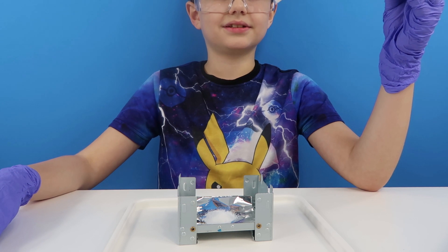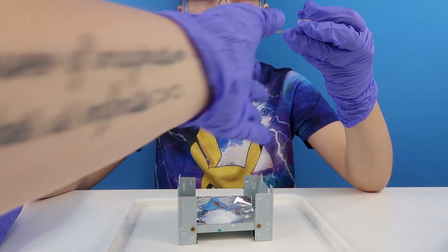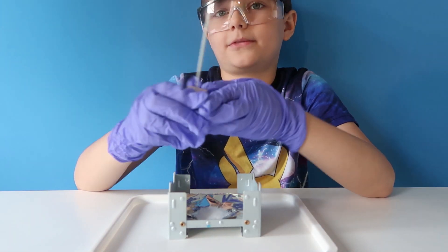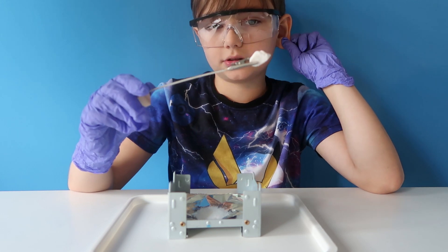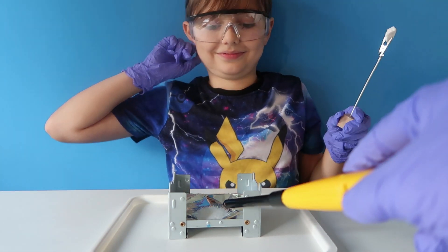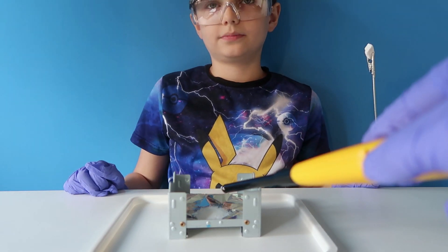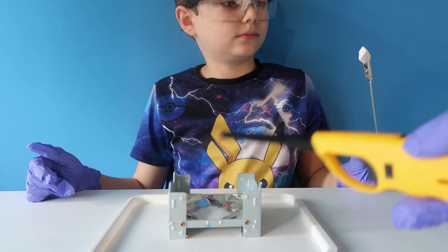It actually says to do this under dim lighting. Do you want to just quickly do that switch Oscar, to turn the lighting off? So what we're going to do — I'm going to light this hexer, whatever it's called.